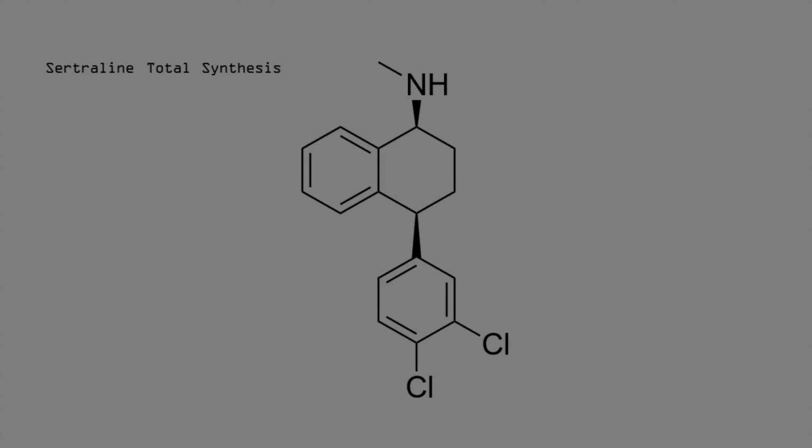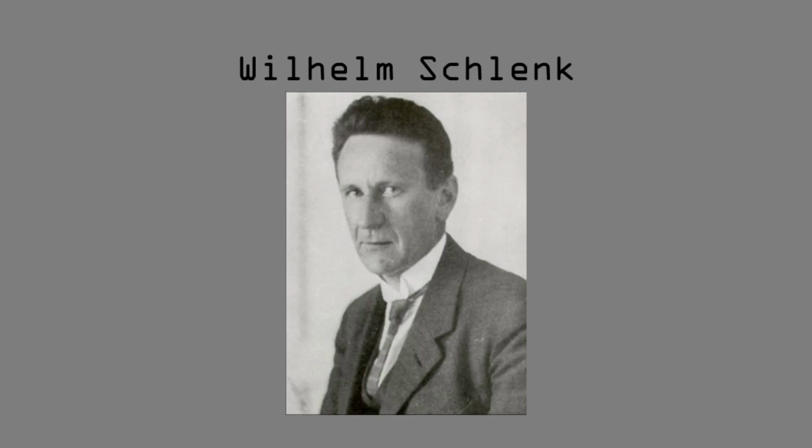In this video, I will be conducting a total synthesis of sertraline. The catalysts I used in this synthesis are sensitive to oxygen and moisture. Therefore, I conducted the reactions under dry nitrogen using the air-free techniques developed by Wilhelm Schlenk.